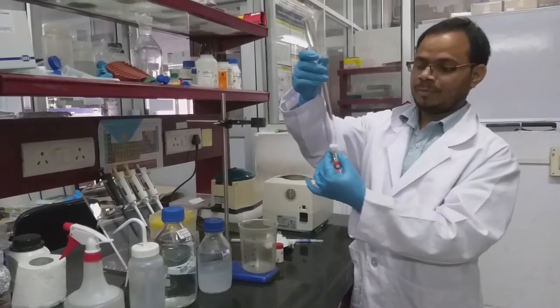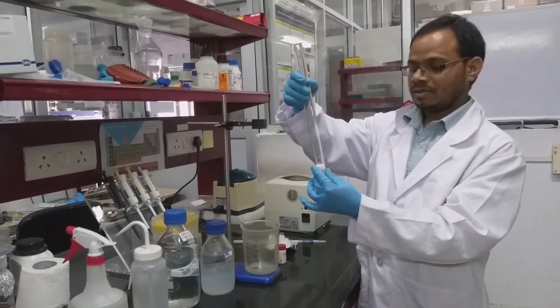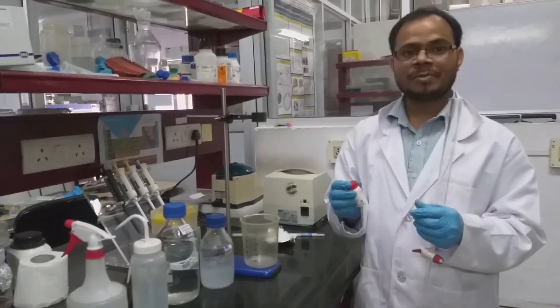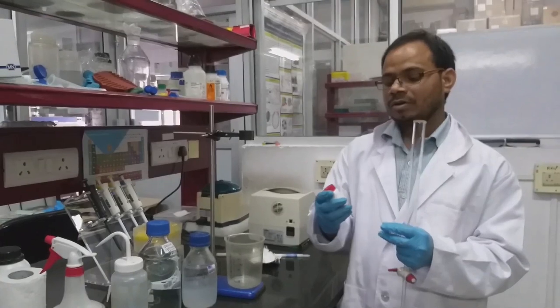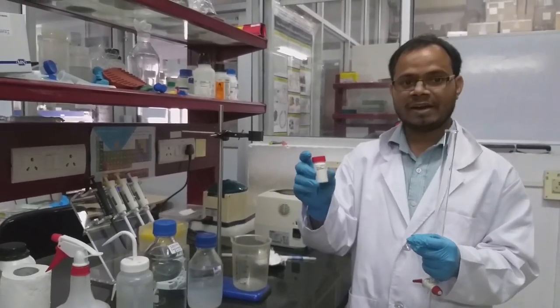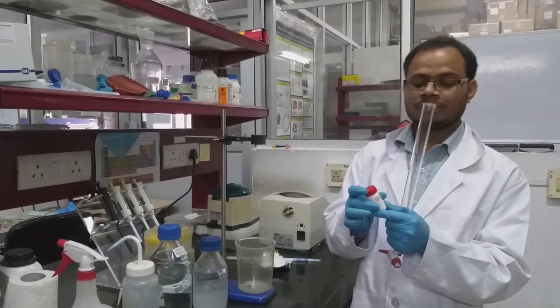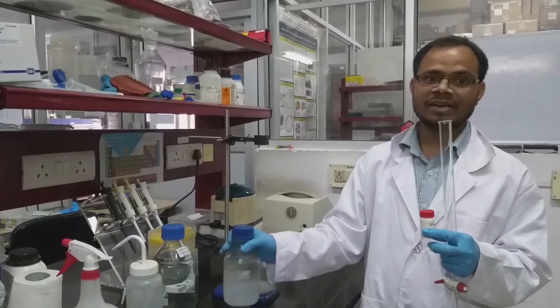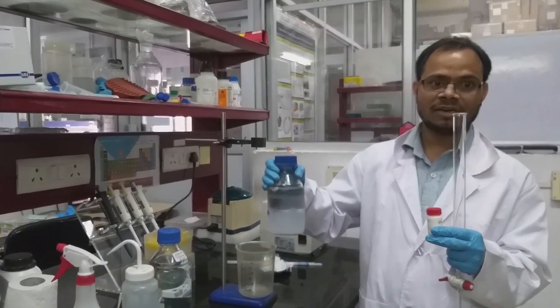So now we block the bottom region. Now we have to load the beads. Beads preparation is very simple. This is the packet. Completely pour it into 500 ml of water. So the beads will swell and give at least 100% swelling.